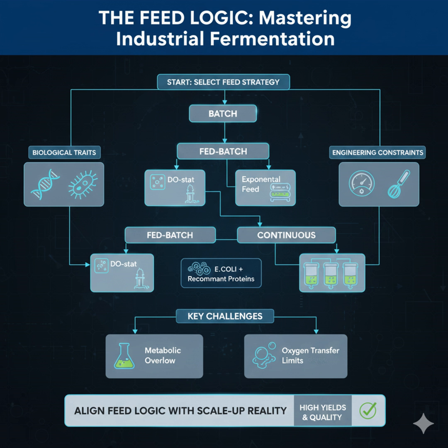So our mission here is to give you a high-speed, high-fidelity shortcut through that whole complex decision tree that process engineers use. This isn't just about picking batch, fed batch, or continuous. The ultimate goal here is ensuring you get a stable, high-quality product. It doesn't matter if it's a therapeutic protein or a complex small molecule. You have to actively steer the organism away from its inherent, well, its bad habits.